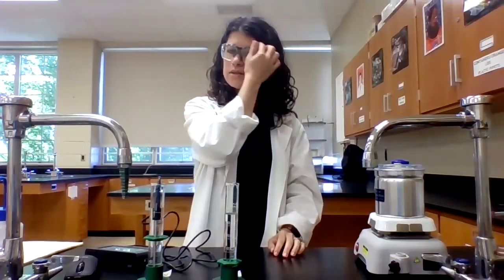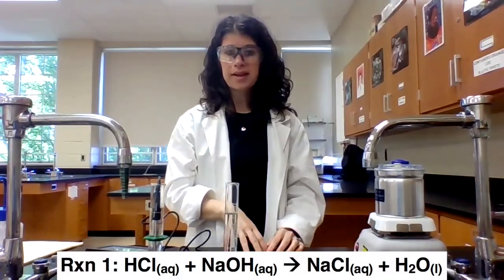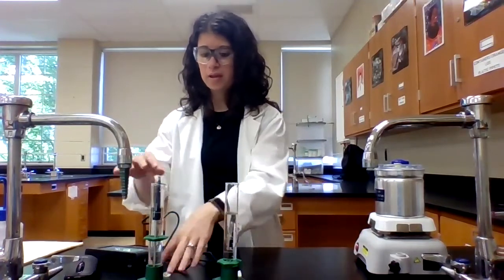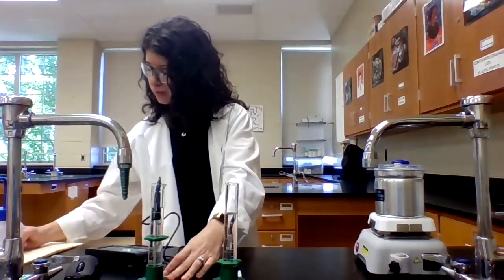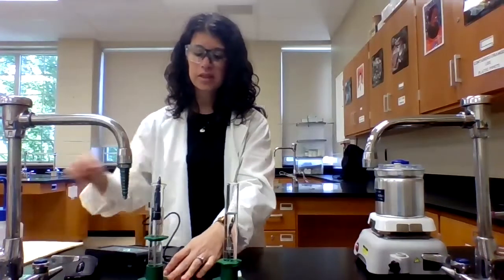So now I'm ready to start my reactions. The first reaction I'm going to do is I'm going to react 2 molar hydrochloric acid with 2 molar sodium hydroxide in a double replacement reaction. So I need to figure out the initial temperatures of my 2 reagents. Again, I'm using my temperature probe here. I'm measuring first the temperature of the sodium hydroxide, and that is reading at 22.5 degrees Celsius.